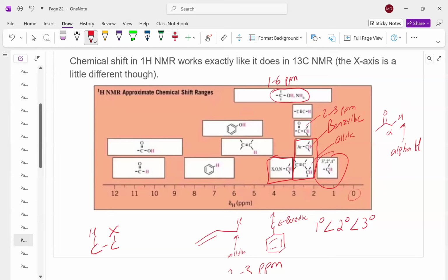So you could literally take it one day and that proton would be in one position, and then maybe you put it in the fridge, take it out, and take the NMR again, and it might be in a different spot because it's not hydrogen bonding to the same degree. So it's just one of those weird things that those typically appear in a variety of regions on NMR.